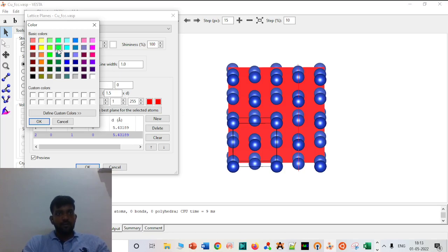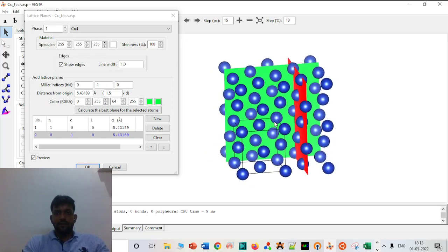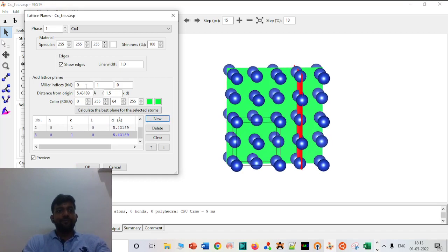So let me use the green option. Okay, perfect. So green and red. Any other plane you want to see? I want to see, not you want to see, because I am making this video for teaching purposes. So I am teaching myself, and with that you can also learn.